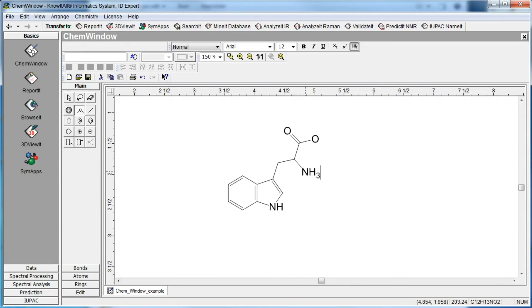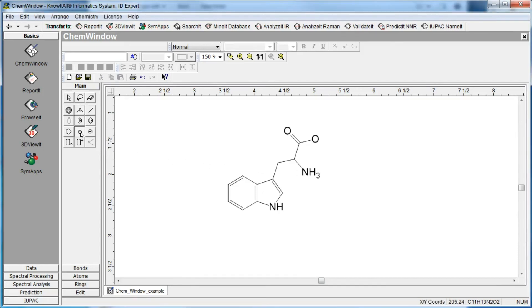We can also add tags to atoms in the structure. For example, atom tags can be used for charged atoms. Select the positive charge atom tag tool. Then click and drag to apply a positive charge to the nitrogen atom.